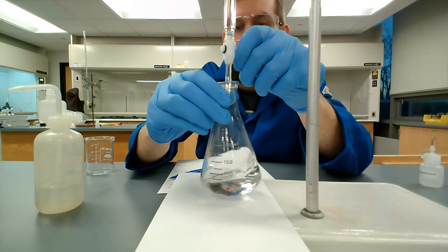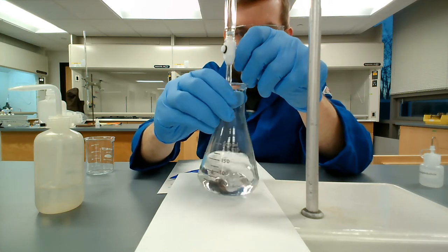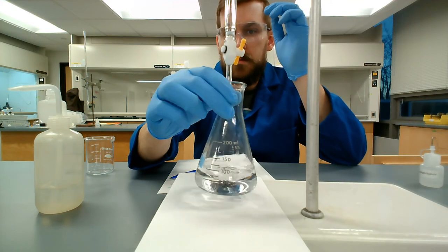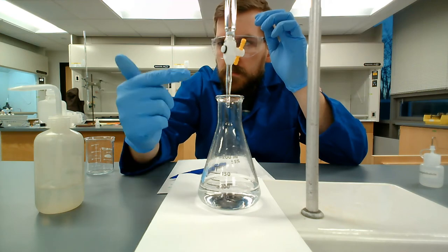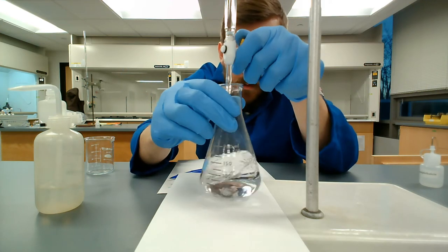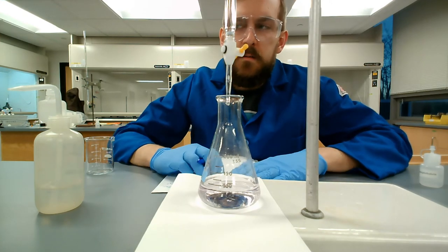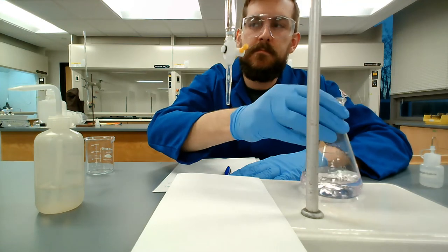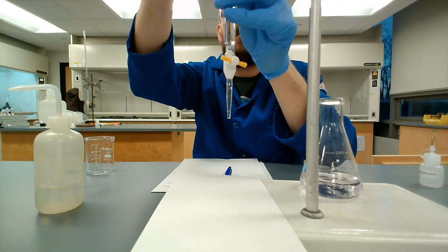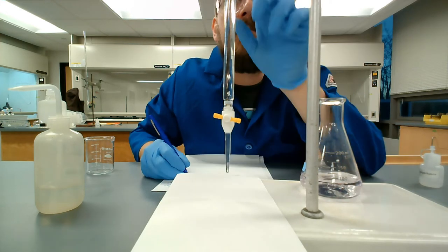So I'm trying to go slow here. I'm trying to go a drop every 2 seconds or so. Drop, drop, drop. I'm trying to demonstrate how slow I need to go to not overshoot the endpoint, and in doing so, I overshoot it. So the important lesson here is when you're doing a titration and you're getting close to the endpoint, you should be doing nothing but focusing on how quickly you're adding drops and what the solution in the Erlenmeyer flask looks like.